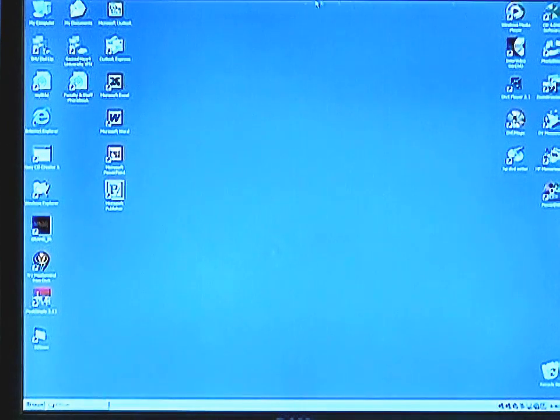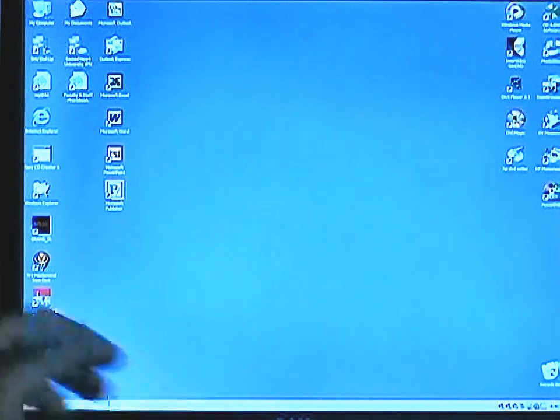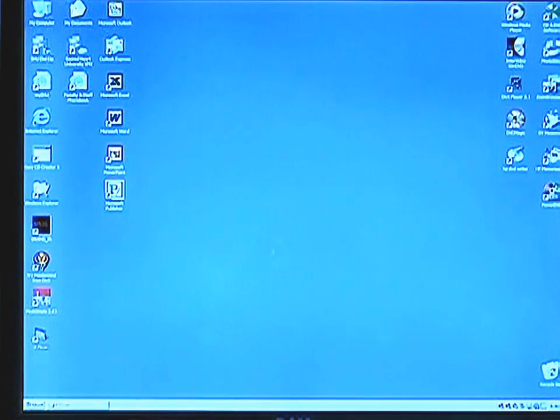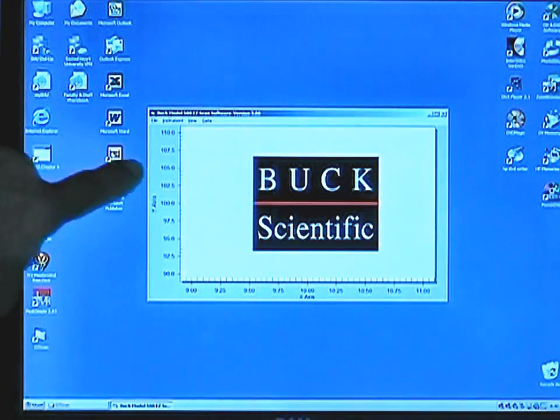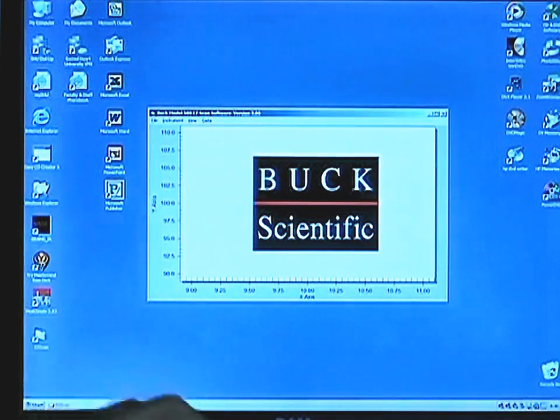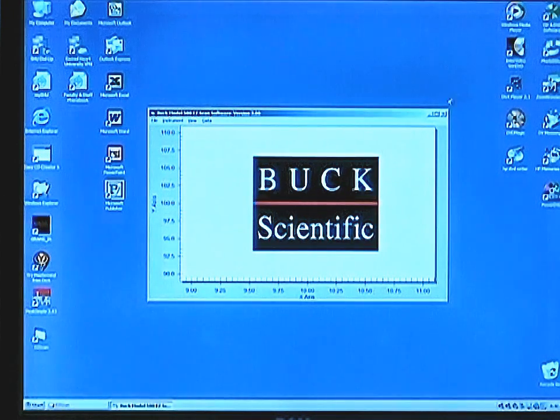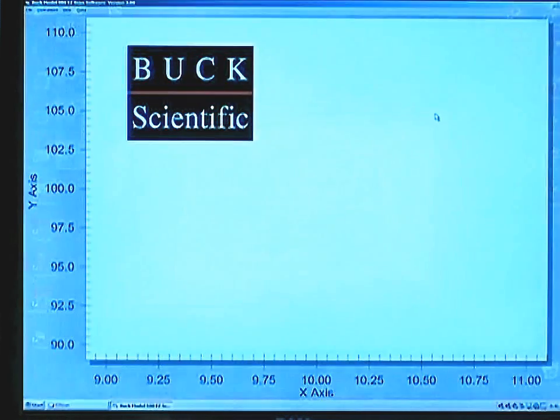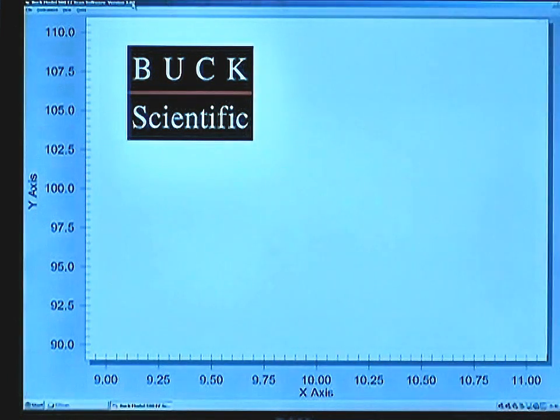Double-click on the Easy Scan icon, making sure the data cables are connected to the back of the PC and the instrument. And you'll get the Buck Scientific logo in the Easy Scan screen. You can maximize this as necessary.